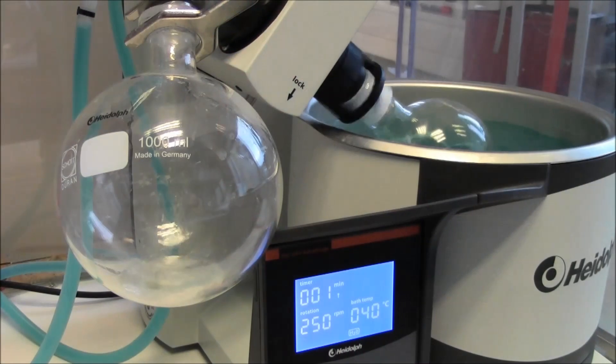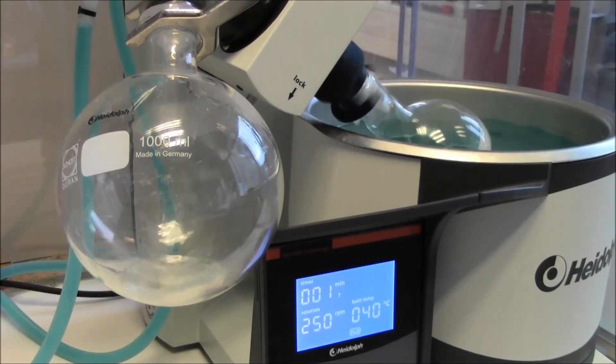The samples are extracted according to parameter and method of analysis. We are able to extract up to 100% of the vitamin content by using specific extractions.